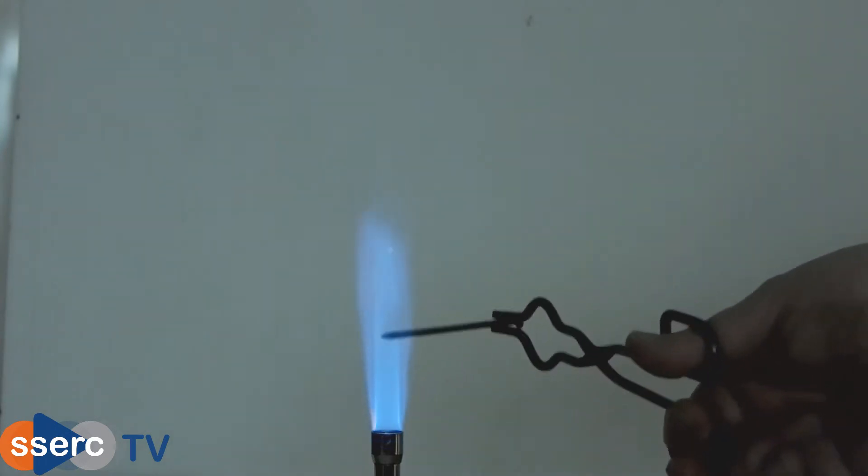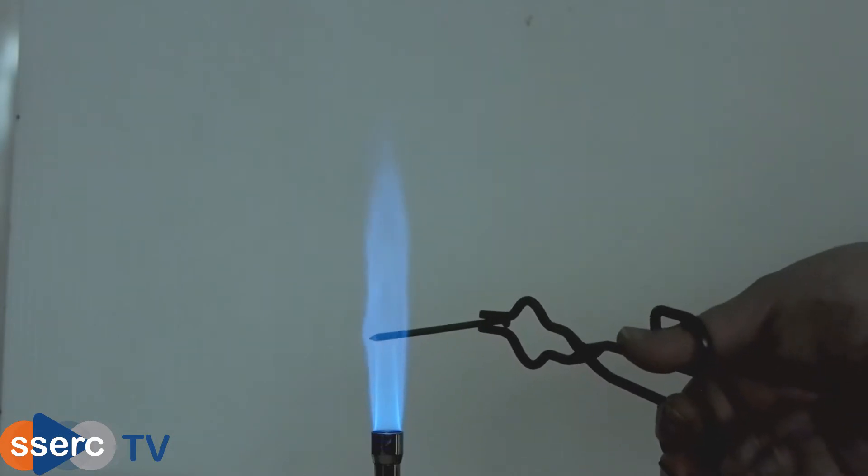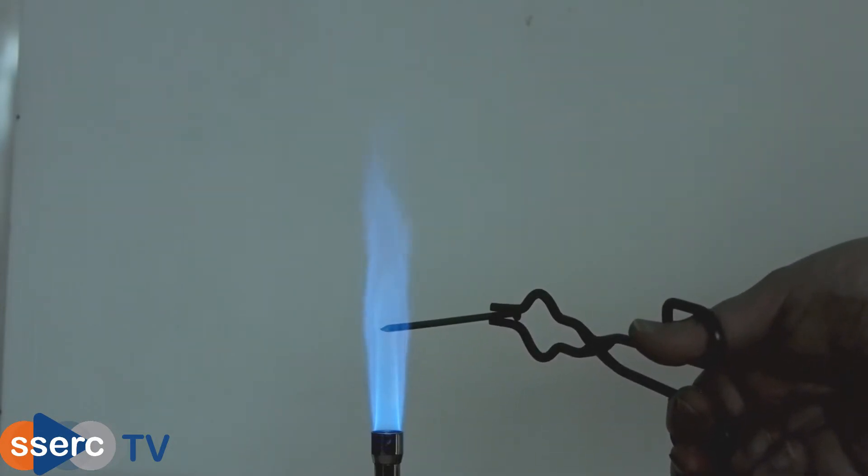If you hold an iron nail in a bunsen burner flame very little happens. If you hold it there long enough it will glow red-hot but there's no real chemical change.